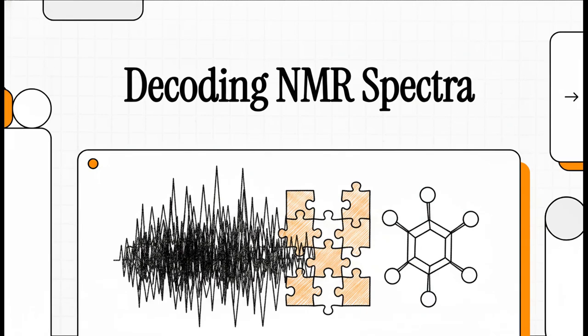Today, we're diving into the visually intimidating world of NMR spectroscopy. If you've ever stared at a spectrum and wondered how a chaotic forest of peaks could possibly reveal an exact three-dimensional molecular structure, well, you are in exactly the right place. We're going to take that messy, overlapping data and transform it into a solvable puzzle, specifically focusing on measuring coupling constants from first-order spectra and navigating the wild effects of strong coupling in second-order spectra.